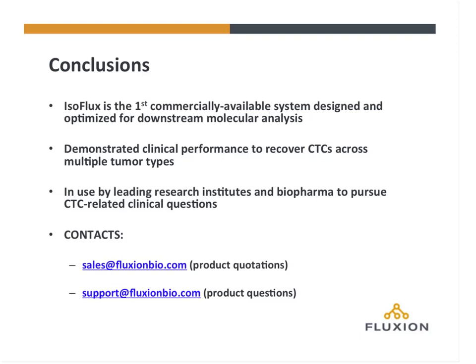When you use the ferrofluid, you typically need a coating of the particles to get enough magnetic moment to be captured on a magnet. And what that translates to biologically is that we can capture cells that have lower antigen expression. So as I mentioned, if you have low EpCAM expression, all you need is one bead to couple to the cell, and we have a good chance of capturing it. So that's one of the key differences.